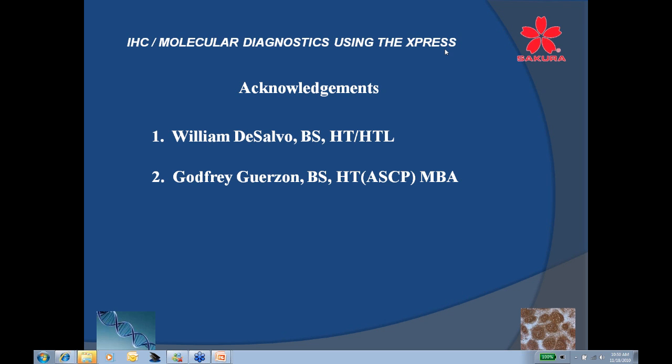No, you're exactly correct. And excuse me, we've done that. When we would validate our things, I would throw in some of the molecular fixative just to see what it would do or not do and the results. And anytime we validated our things, particularly if I was just going to research something on my own, I would pick tissues that I was going to not only do H&Es, but immunohistochemistry on, or maybe even a probe for that matter, to see the results.